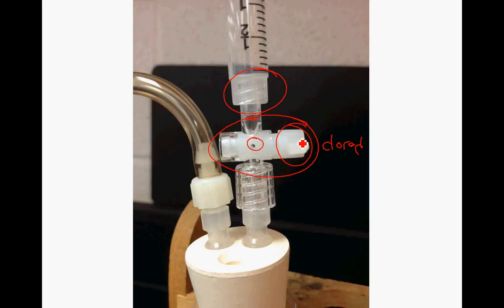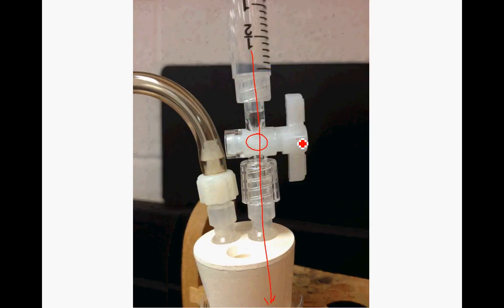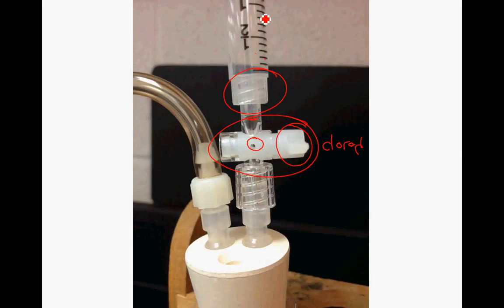Right? So we had some groups not understanding what was going on there, right, and messing that up a little bit. So you want to close that valve so that any oxygen gas that's being produced is going to come up and go this way to the sensor. If this is open, then you'd have some gas coming back up here, and your whole plunger thing is going to just burst out the top of the syringe there. So that's not what you want. So you've got to make sure that that is closed so that your oxygen gas again goes down the tubing there. Okay.